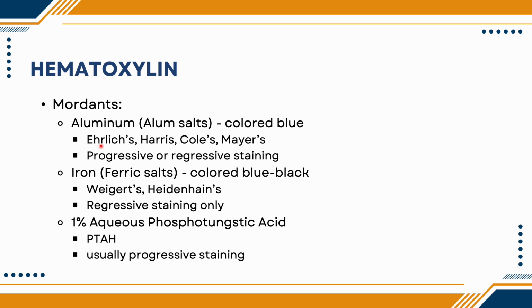So for hematoxylin, you have typically 3 different types of mordant. You have your aluminum or the alum salts, which gives the color blue of hematoxylin.